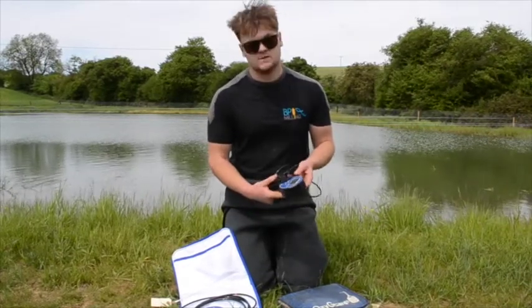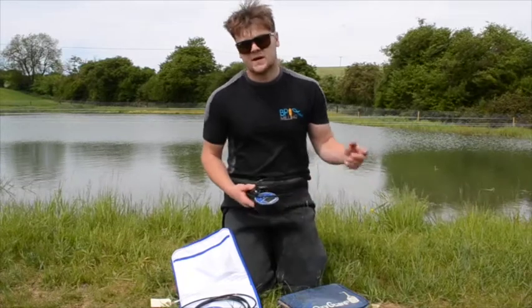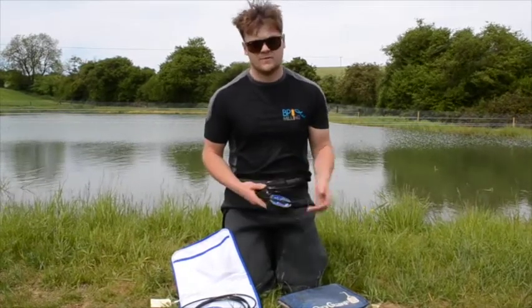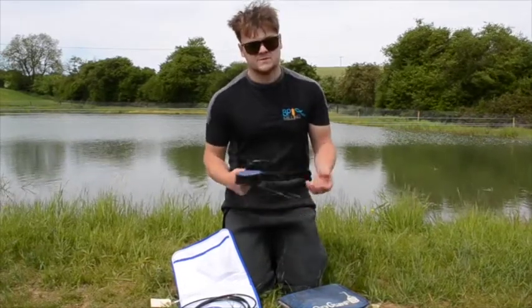This is the most useful piece of kit you can have this time of year. You'll learn so much from just testing the oxygen every morning and seeing how much it comes up and down throughout the day, and at night with your algal blooms and the respiration of your weeds. It's a real useful piece of kit.